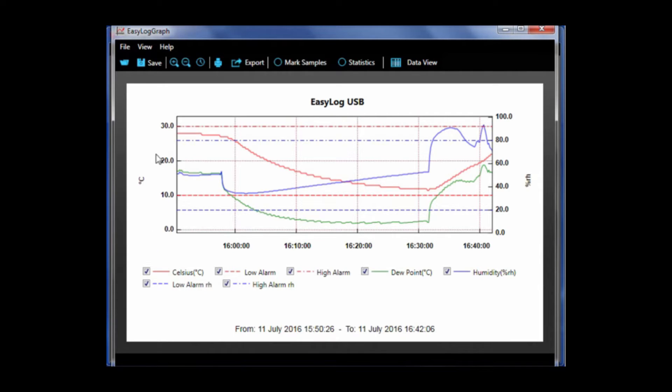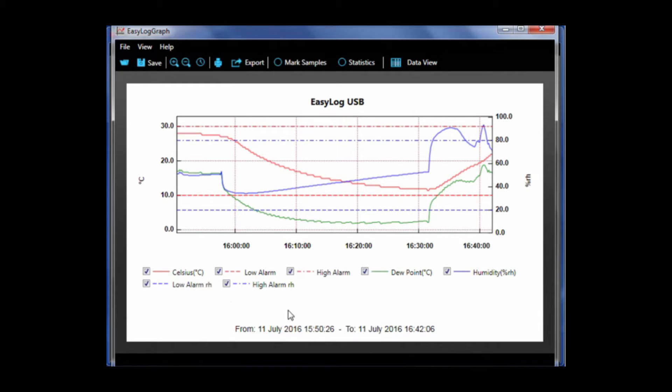On the left hand axis there is temperature and on the right hand axis there is humidity. Note a single channel logger will only have the left hand axis.